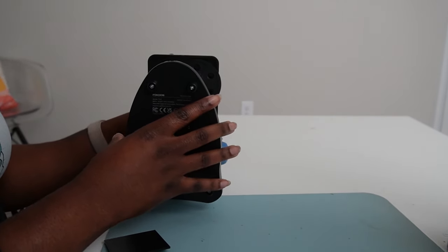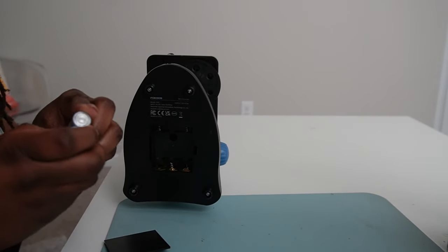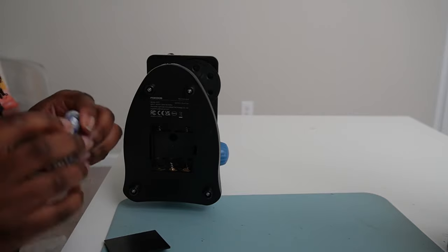Oh that's dangerous! Okay, so this microscope takes three double A batteries.